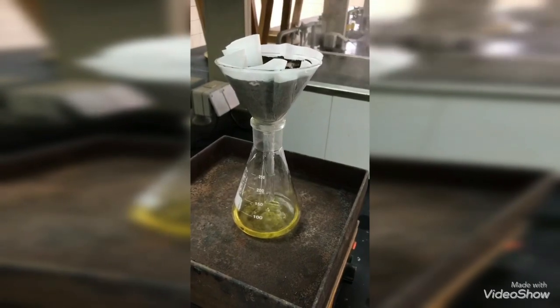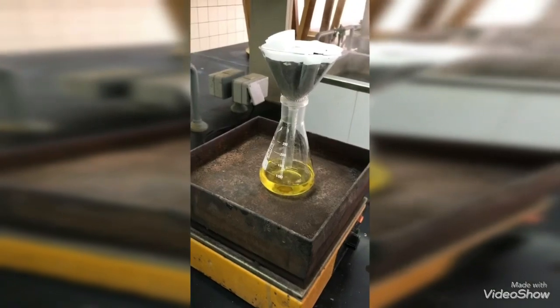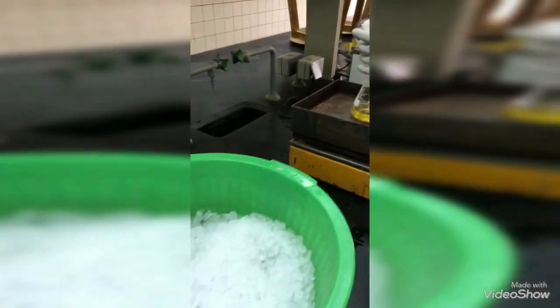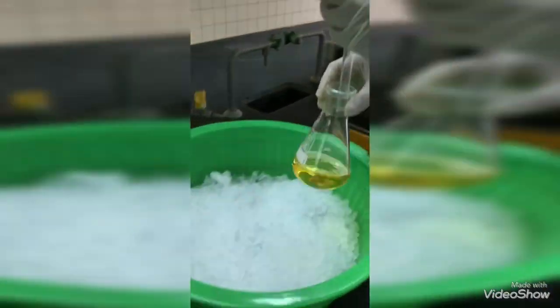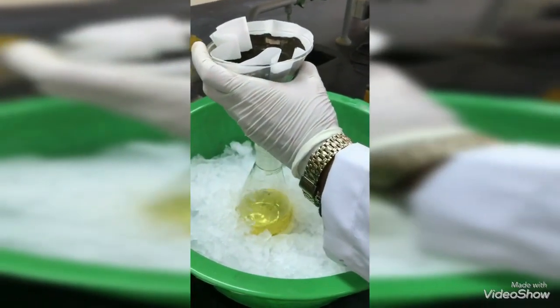Now take off your filtrate, put it in an ice bath for about 3 minutes.